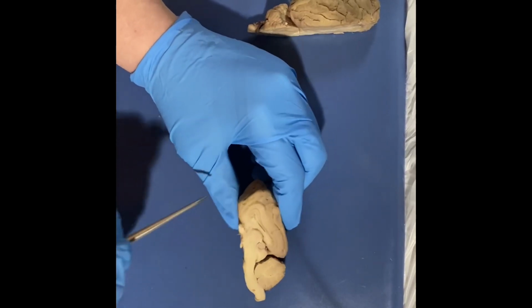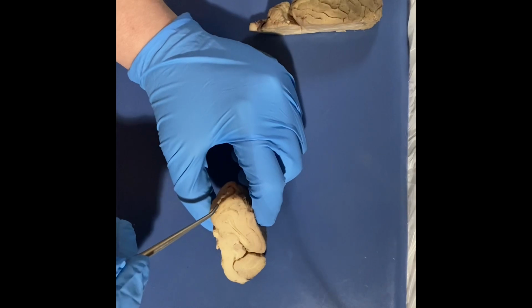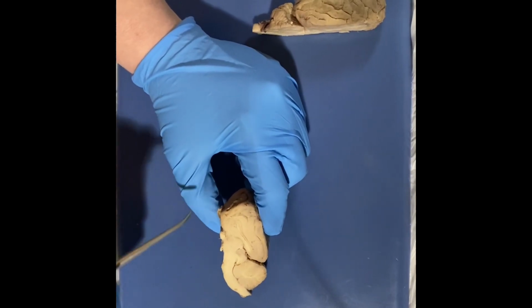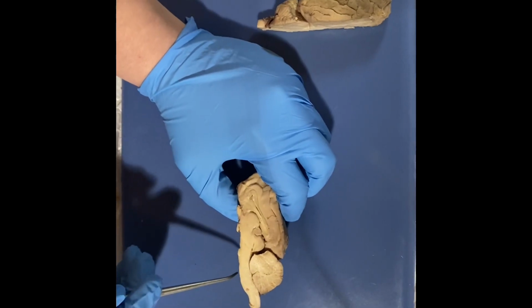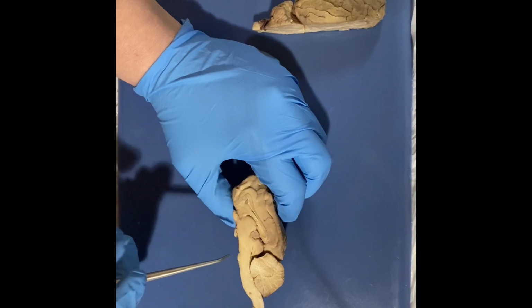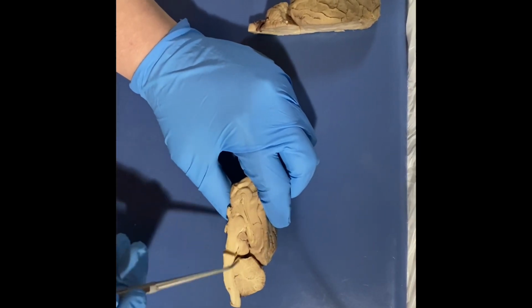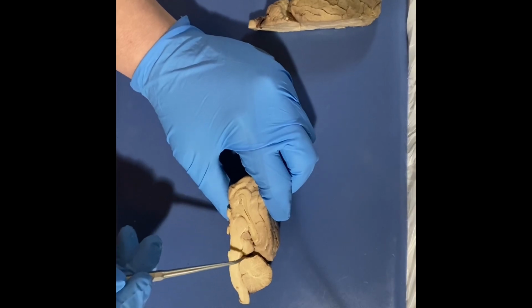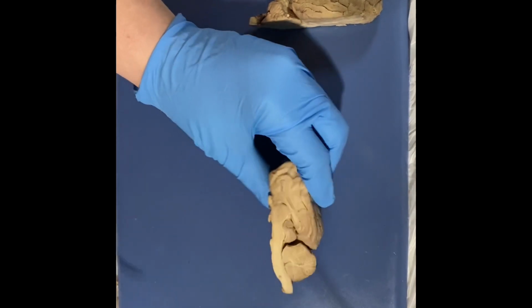Then we'll have the olfactory bulb, which is up in the front of the brain. This holds cell bodies and neurons. And then we'll have, at the end here, the cerebral aqueduct that connects the third and fourth ventricles. And that is the brain.